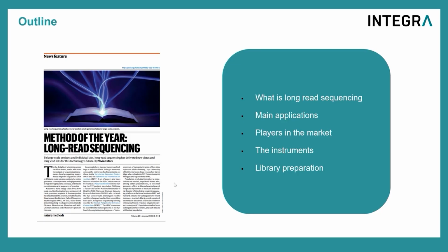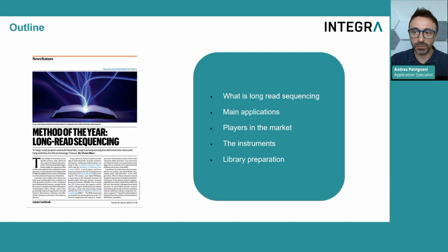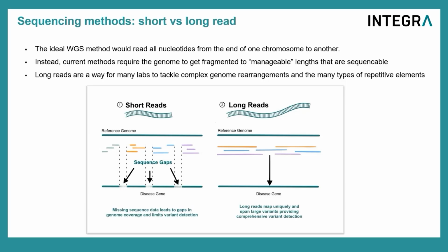Here is a quick overview of what we'll cover in this video. We'll start by exploring the advantages and applications of long-read sequencing. Next, we'll discuss the main players in the market, their technology, the instruments they offer, and how sequencing libraries are constructed. Let's get started.